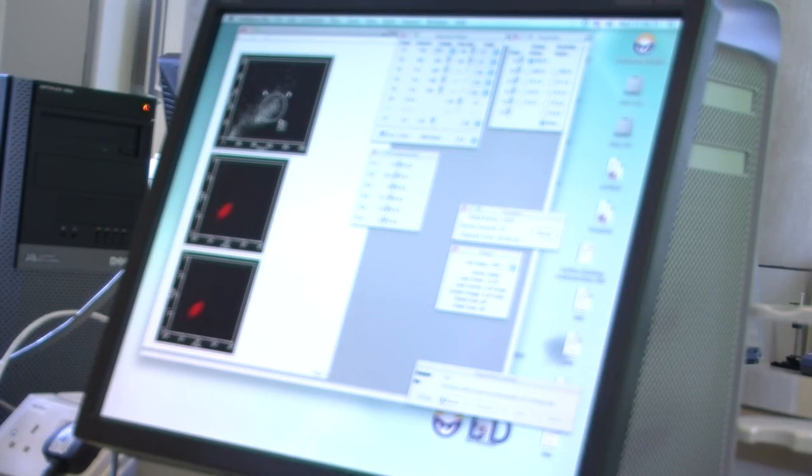So those ones are the positive. Right. So the positive control is brighter than the negative control, which is good. There are experiments I've run and I've seen where that isn't the case. And then you've got to try and work out what's going on. But here, that's good. We've got staining where we should have staining and not where we shouldn't. So far, it's worked really nicely.